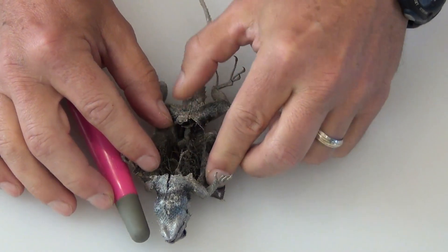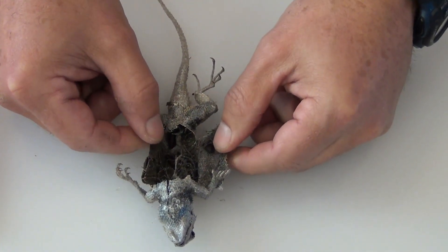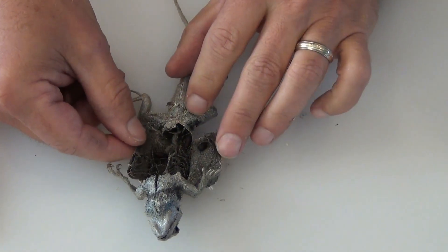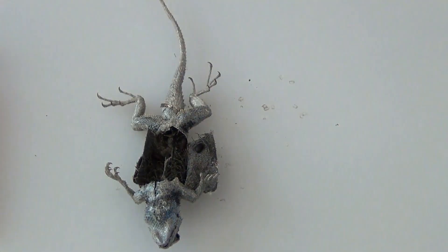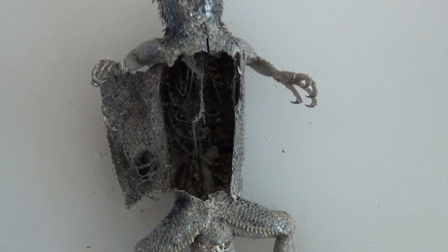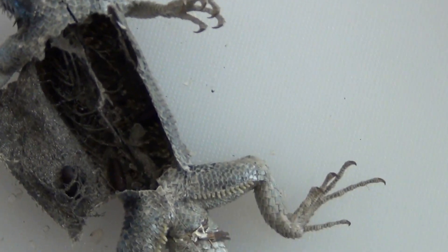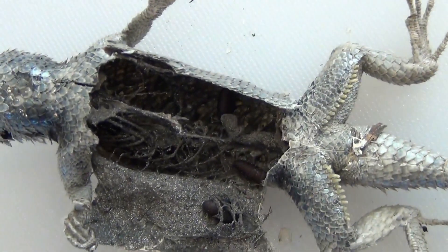When I open it, I guess it's about what you would expect. I'm going to hold it up to the camera to get a really clear view. I can see the spinal column. Here's a really clear view down inside - if you look, you can see the spinal column running down the middle with all the ribs on it.